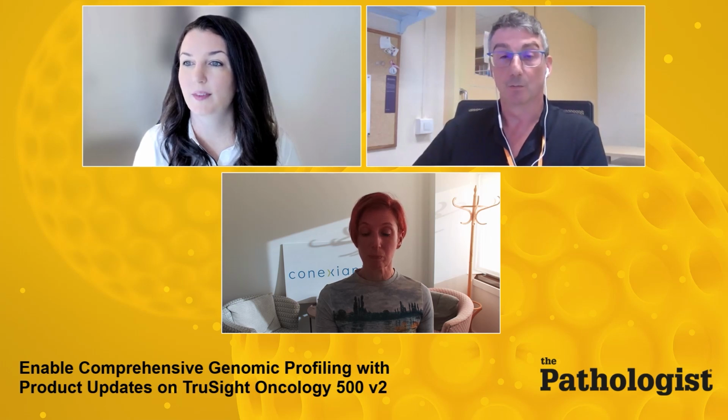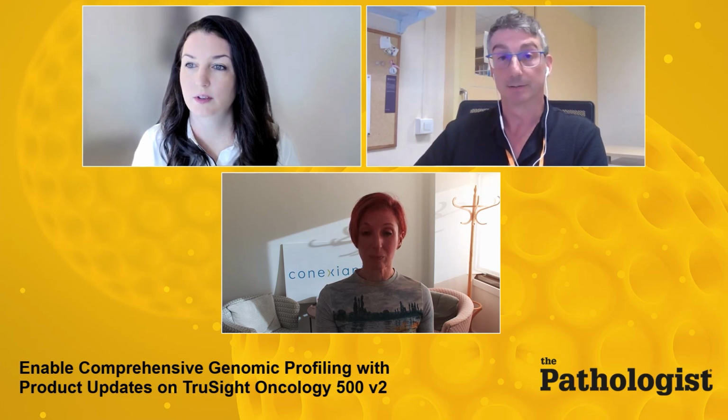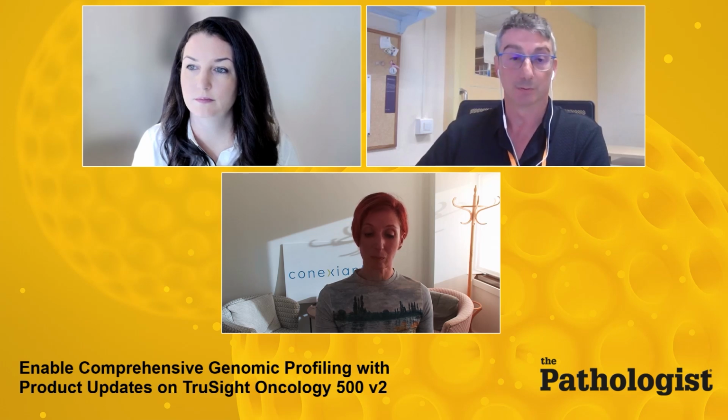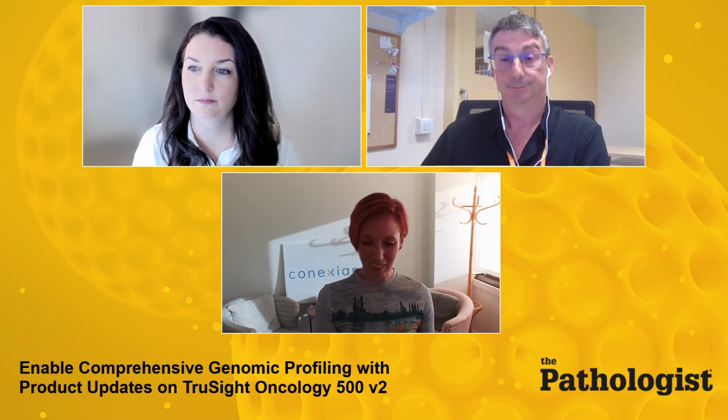Yes, we have the Hamilton and the Cyclone of Perkin-Elmer robots in our lab, and the next step is to automate the protocol in order to reduce the time producing the libraries. Thank you.